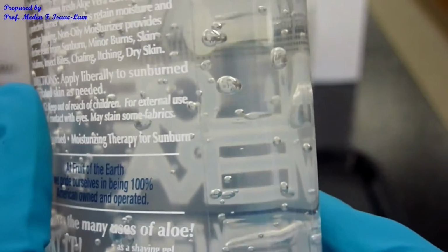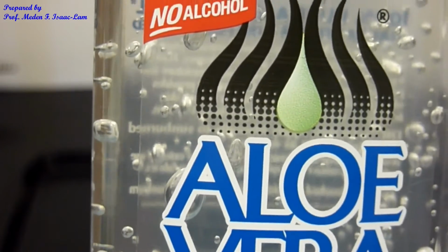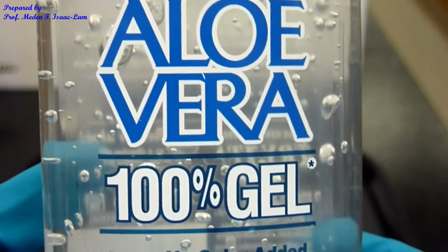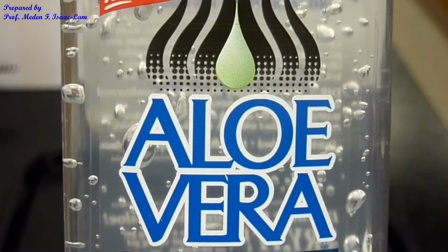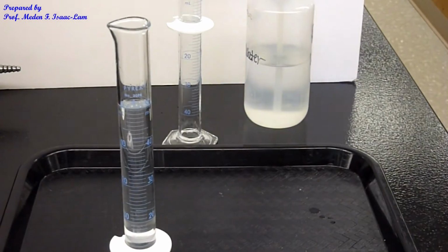If you are using the natural aloe vera, it still has active enzymes and it would tend to precipitate out. However, for this one, it's not entirely clear. There's a little bit of turbidity, and I will show you later. We have a hand sanitizer here in the lab, but let's prepare this one.